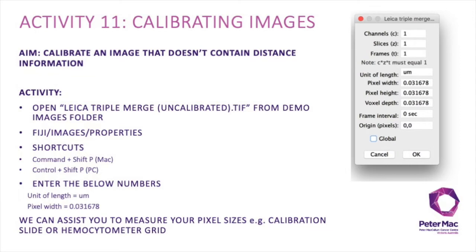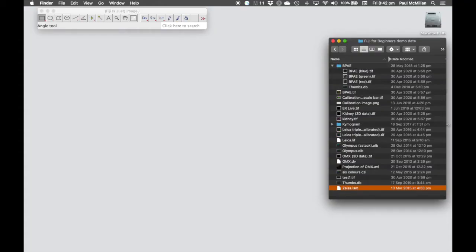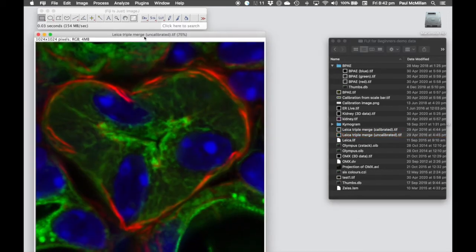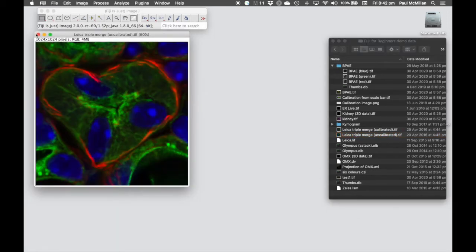Activity 11 is calibrating images — adding distance information into an image that hasn't carried that information across from the microscope, so it's an uncalibrated image. For this example, we're going to open LeicaTripleMergeUncalibrated.tif. If we open this up, you can see in the top left-hand corner it has no distance information, only pixels.